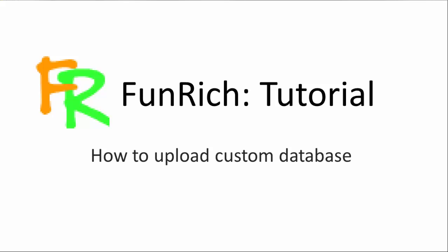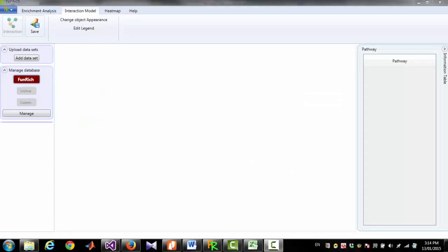Hello everyone, this is Mohsin Pathan from Funrich tool, and today I am going to show you how you can upload your own database to Funrich from an Excel file or tab-delimited text file.